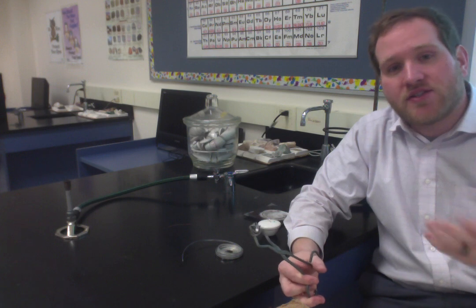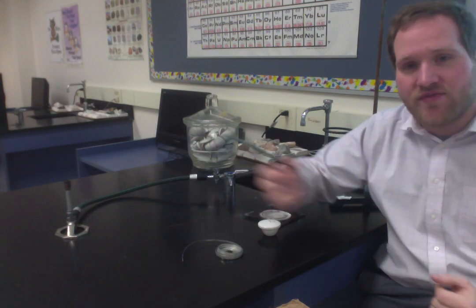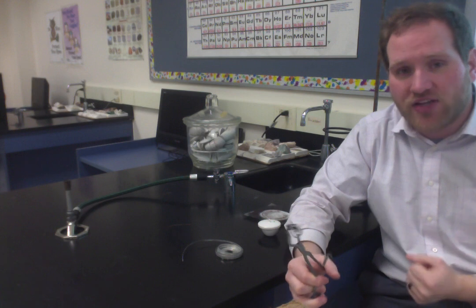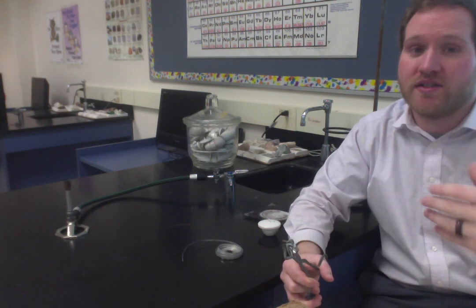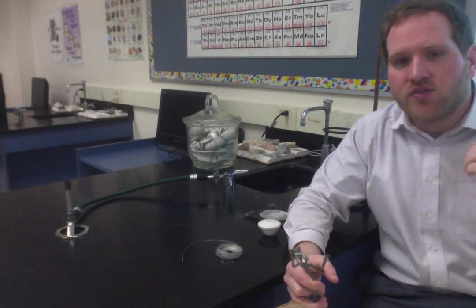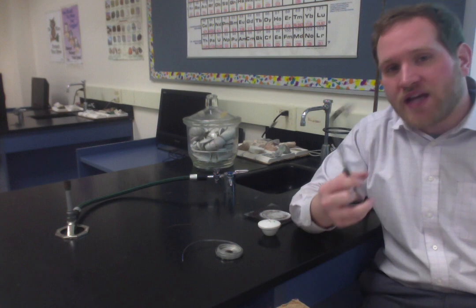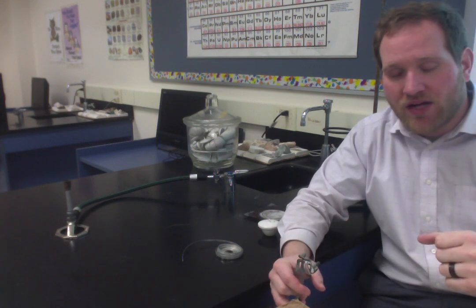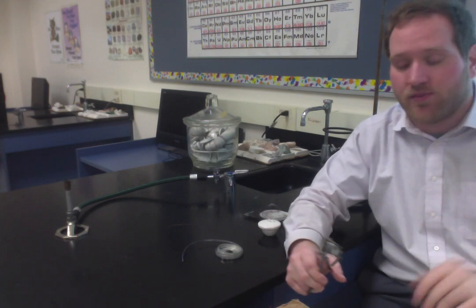Now, nitrogen normally doesn't react with things because it's less reactive than oxygen. But if you just crank the heat on this and put this directly in there, it'll be so hot that the nitrogen will actually react too. And you're going to form magnesium nitride instead, or in addition to magnesium oxide. So again, we must do a controlled burn so that only oxygen bonds with it. Because if you burn it too fast, nitrogen will bond with it as well, which will mess up our results. It's not dangerous, it just will mess up our results.